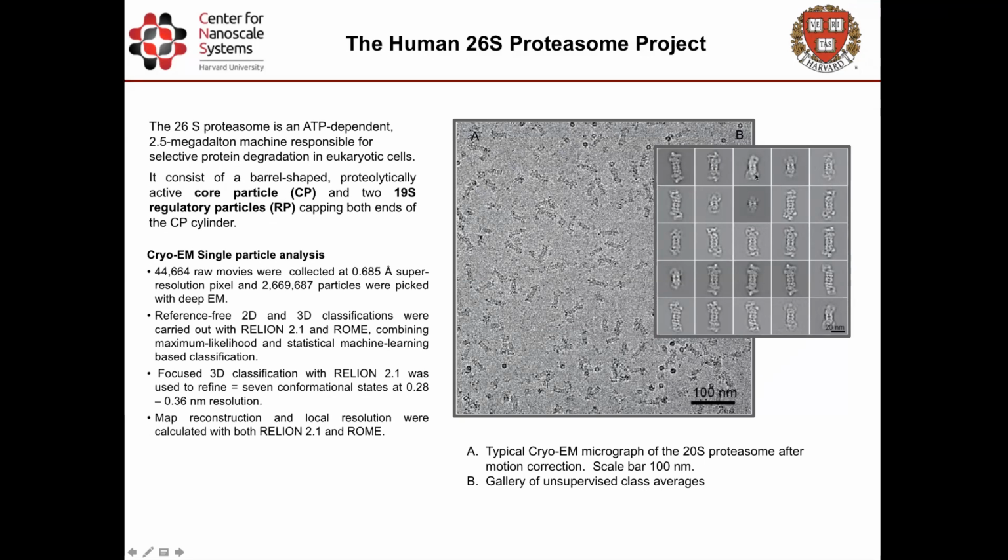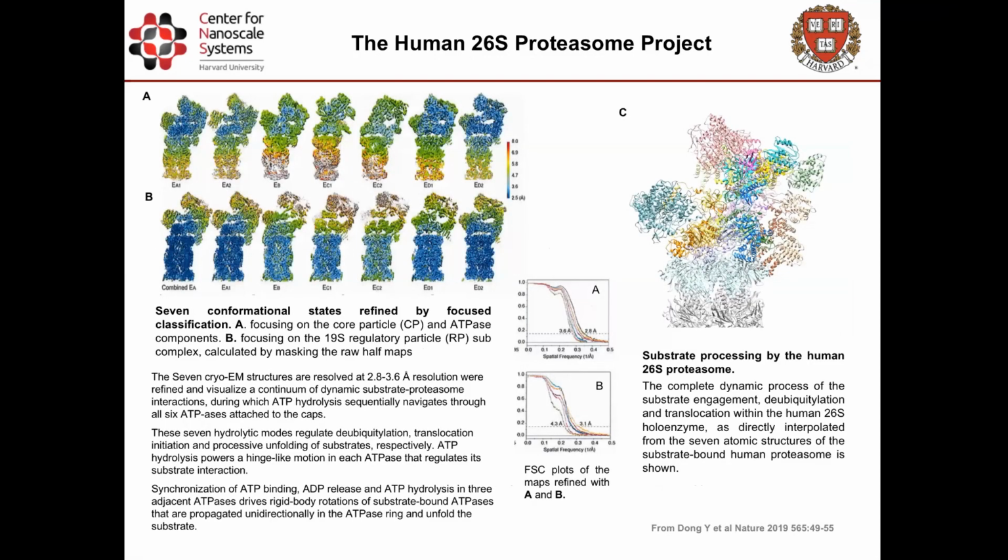And here are 2D projections calculated from the original cryo electron micrograph. It's a quite big molecule, therefore it allowed us to do this high resolution with a 200 kV microscope.